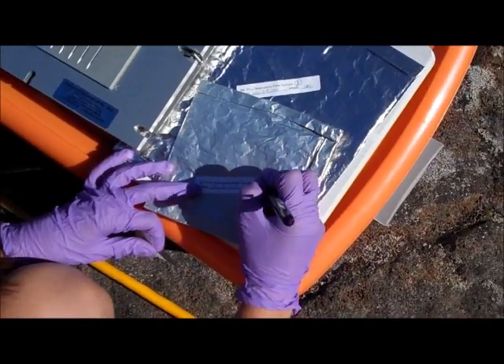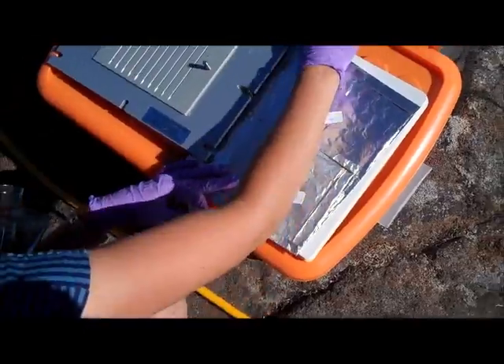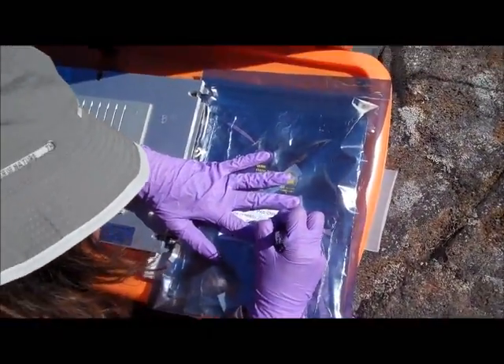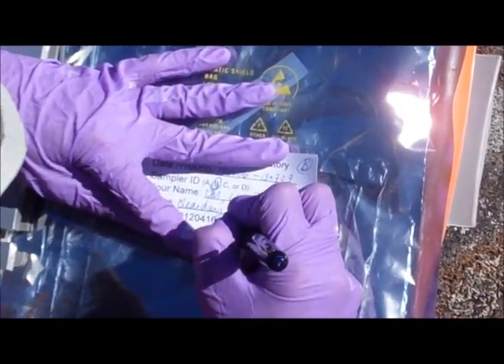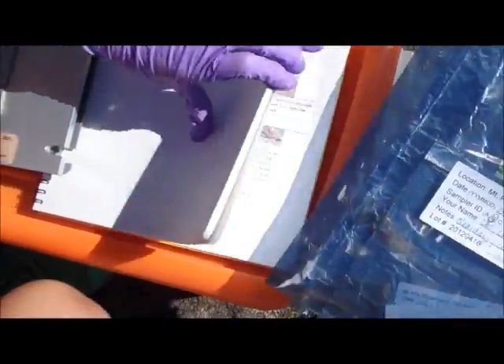I'm recording the date range that the three samplers were running, and noting that this is sample B, which has a data record associated with this specific sampler — so we'll know exactly when it was running and how much volume was pulled through. The label notes include the date range, B circled, my initials, clear sky, small bugs — preserved and removed. Just a little note in case somebody doesn't check the notebook immediately when looking at the samples.